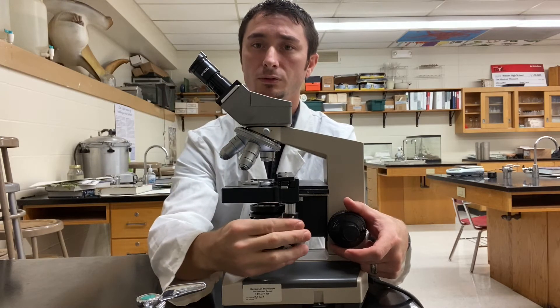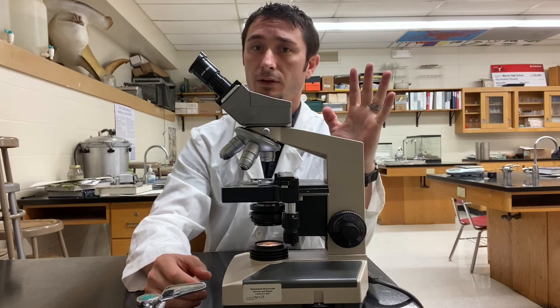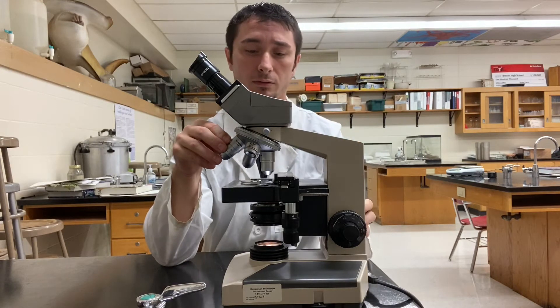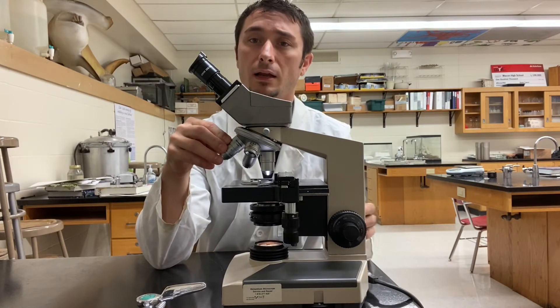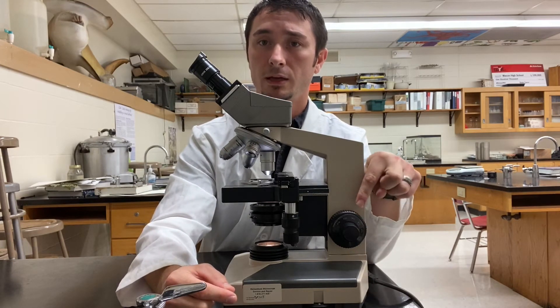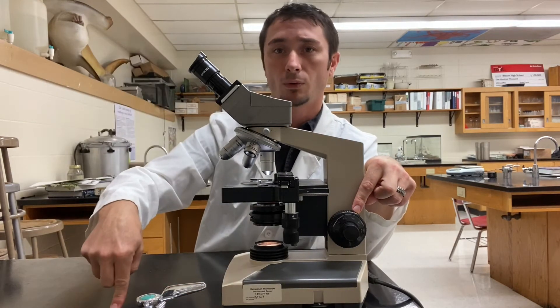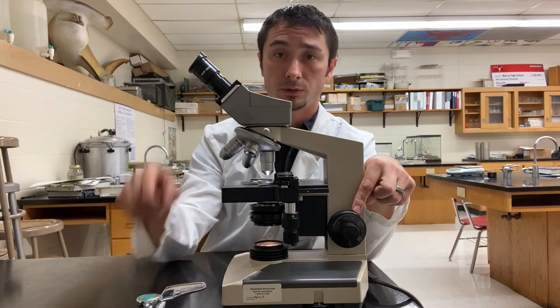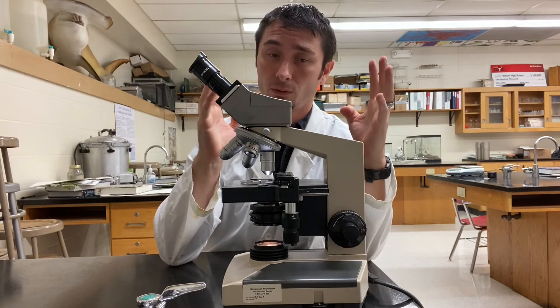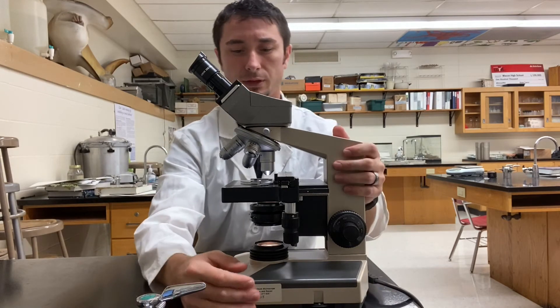Once you have the 4x in place, use your coarse focus and bring it up until you see the image in the eyepieces. Once you see it, try to center it using your mechanical stage controls, then get it crystal clear again with your coarse focus. After that, rotate the nosepiece to the 10x or 40x. From here on out, use only the small fine focus — no longer the coarse focus. If you use the coarse focus at higher power, it will move the stage too fast and could jam the objective lens right through the slide and break it, meaning you pay for the slide or potentially the microscope.